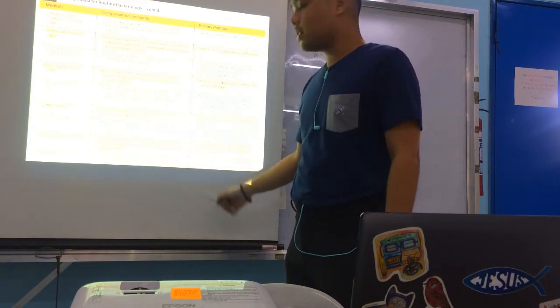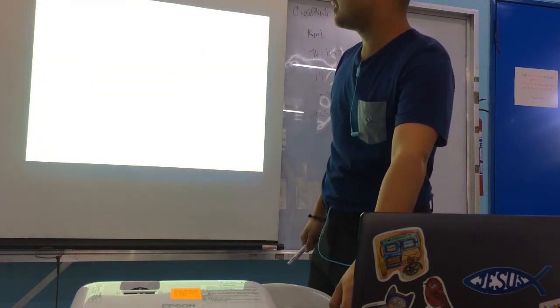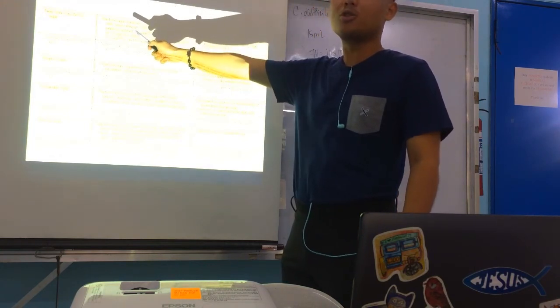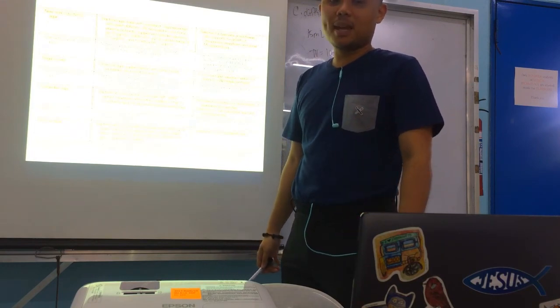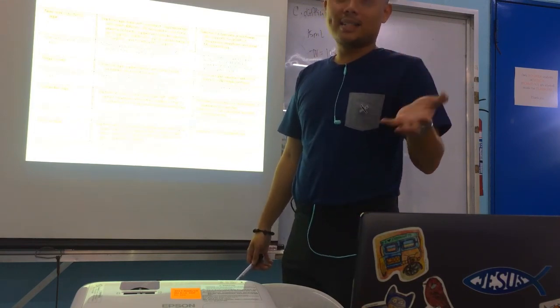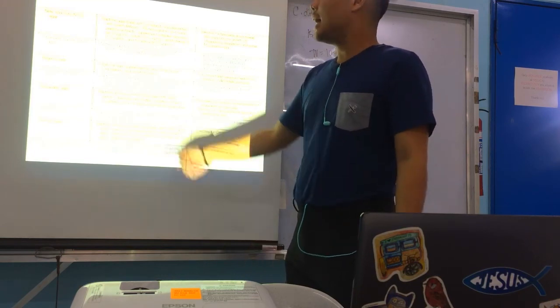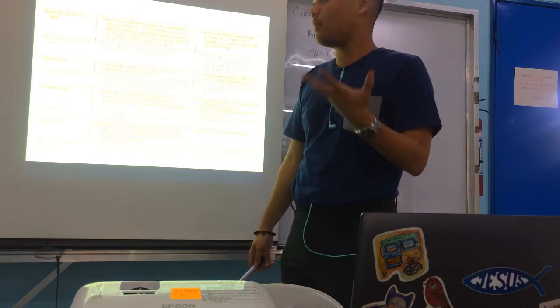And MSA you have for Staphylococcus species. Staphylococcus aureus, yellow colonies on MSA. And last slide, you have NYC agar, one of the many culture media for Neisseria gonorrhoeae. I believe in a later lecture we will discuss the different culture media for Neisseria gonorrhoeae. There are other culture media, but an example is NYC. They have their own components, like antibiotics.